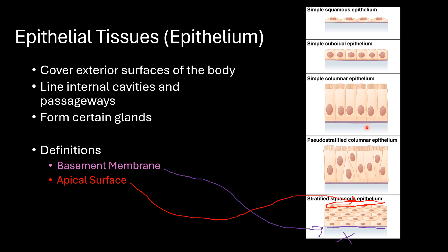Looking at other images, we have our basement membrane and then the apical surface above. Again, basement membrane on this one — below it there are other tissues, and above we have the apical surface where there are no cells that it's in contact with.